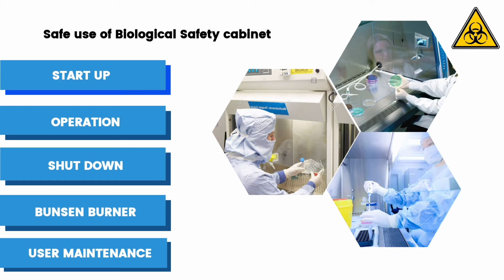Shutdown. Clean the workspace, side walls and glasses using disinfectant solutions before shutting down the equipment. Make sure the equipment runs for 5 minutes for the decontamination process. Used biohazard bags must be properly sealed.